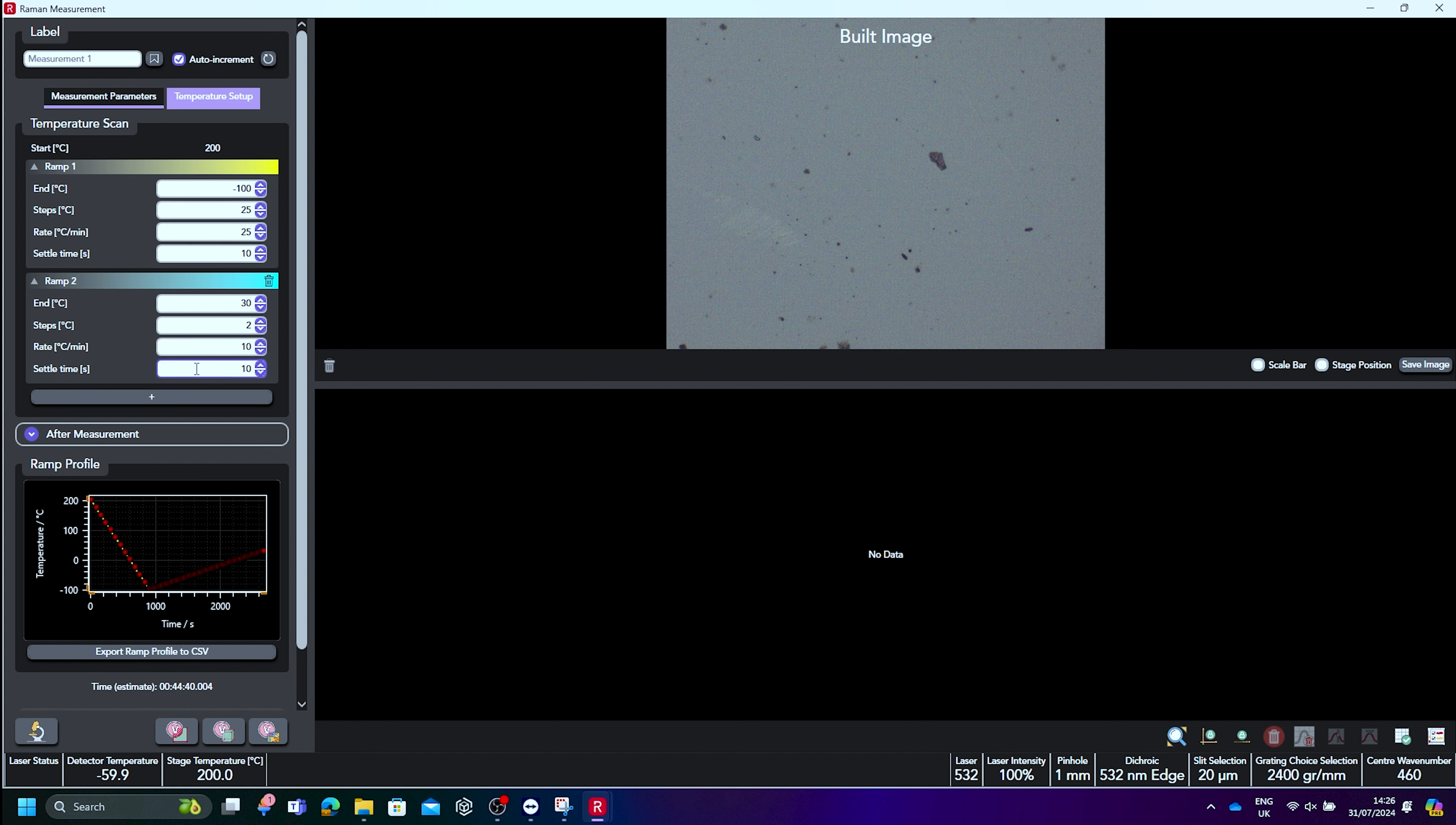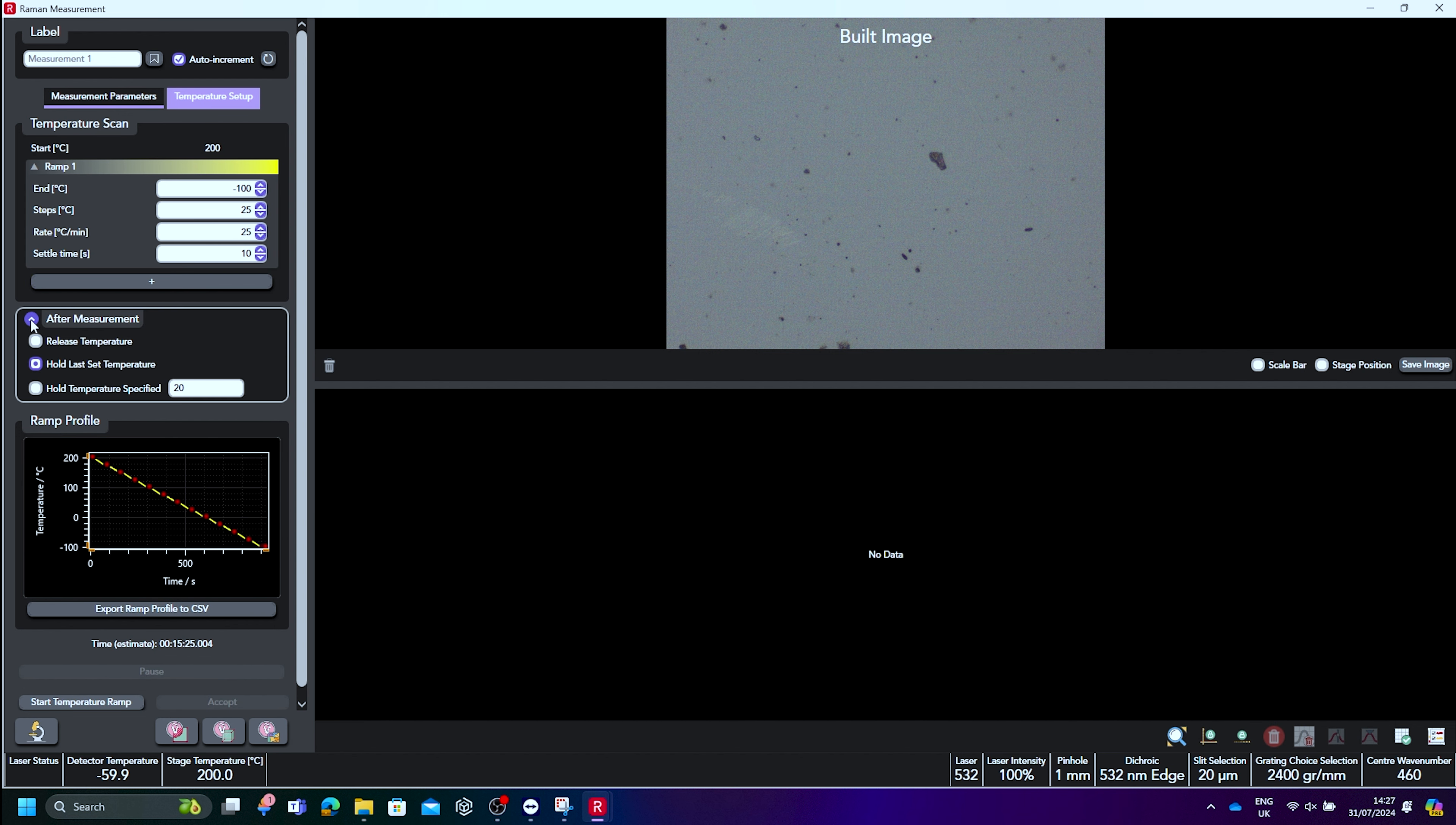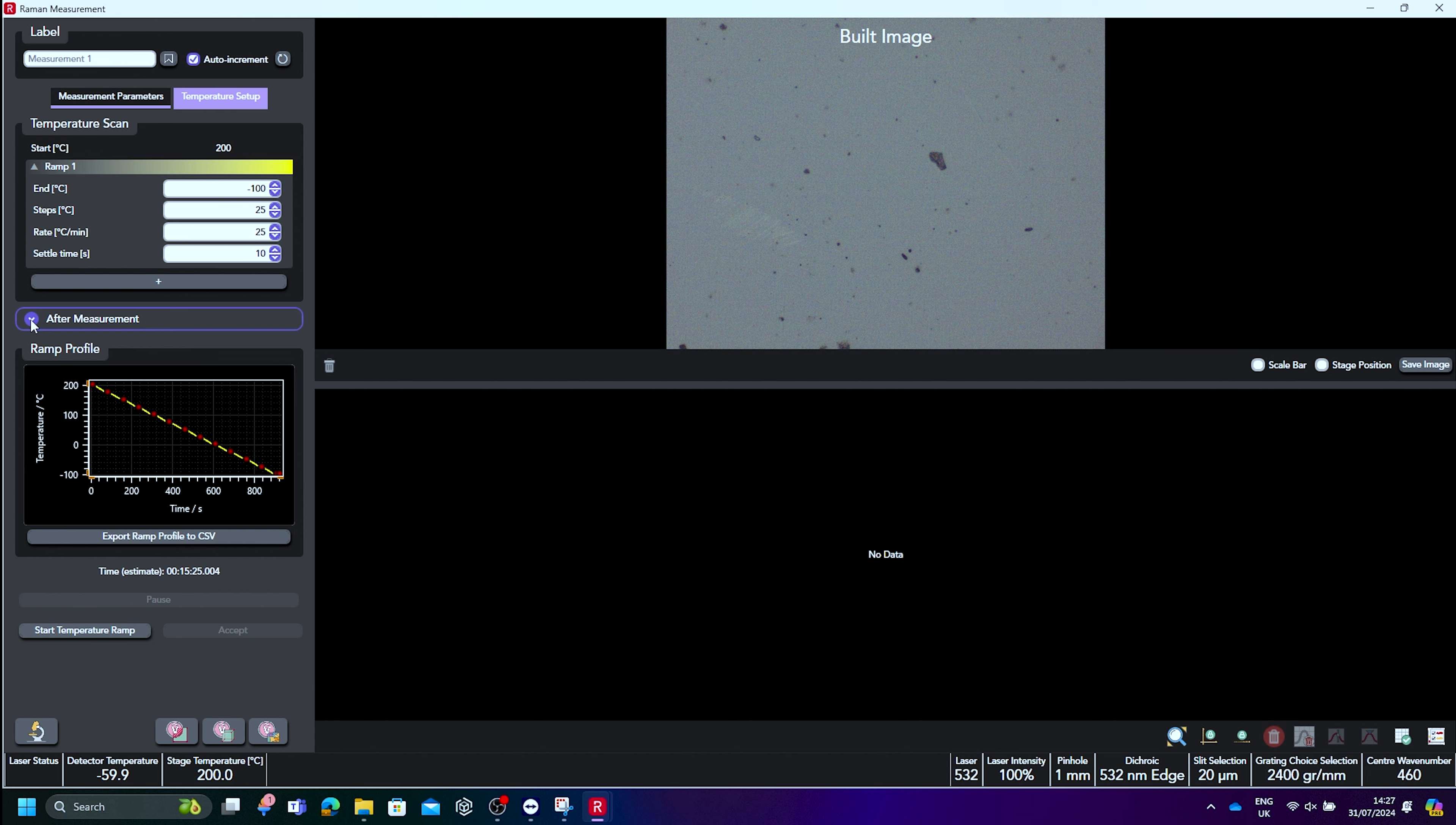It's possible to add an additional temperature ramp and perform cyclic measurements. We can also control the temperature of the stage after the scan, and can either release the temperature or hold it at a specific value. To begin the scan, click start temperature ramp.